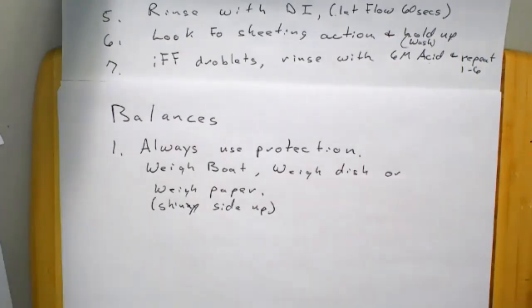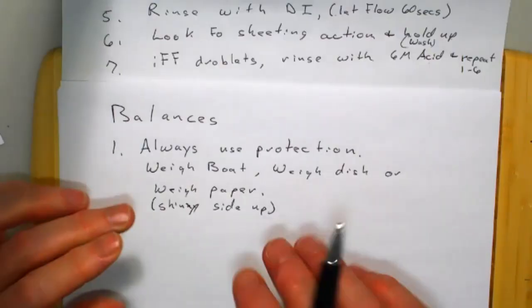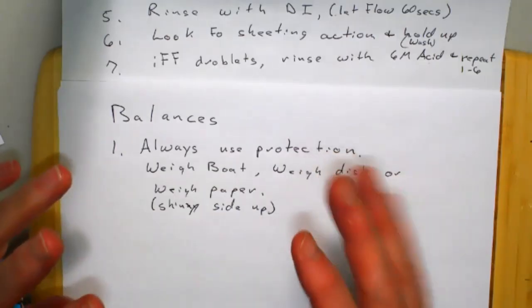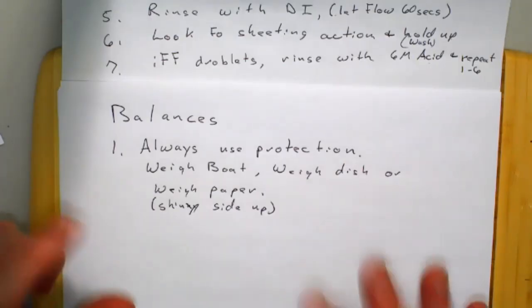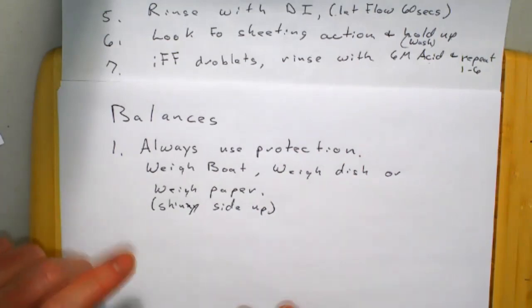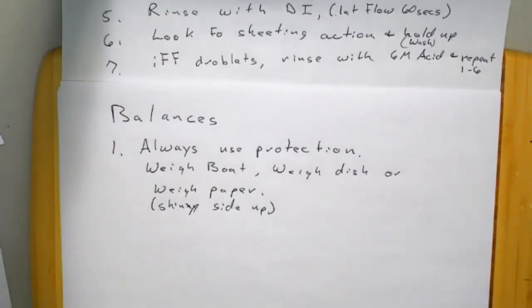You can pre-shape it. I fold it in half, but you don't want to handle it a bunch, because the latex gloves do allow water through. Your hands still get sweaty, but water comes through. You don't want a little bit of water on there. It will evaporate pretty quick, but it might not all evaporate. So don't handle your weigh paper too much before you start your weighing.